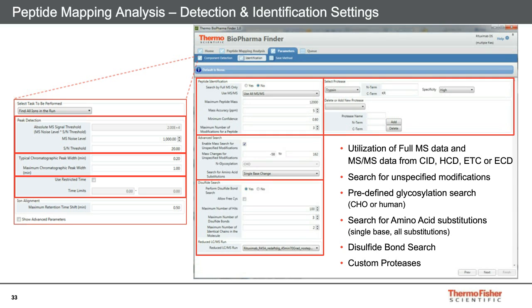In the peptide identification panel, mass accuracy can be defined and should not be higher than 5 ppm for Orbitrap-based spectra. In the advanced search window, the range of unexpected modifications can be set — for example, a mass shift of minus 58 to plus 162 in addition to the defined variable modifications in the sequence manager. Glycans are also defined in the protein sequence manager; here we can search for CHO or human glycans. Amino acid substitutions from single-base exchange or all substitutions can be included. There is also a section for disulfide bridge searching where the raw file of the reduced run can be defined. The last window allows selection of the protease and definition of custom proteases.